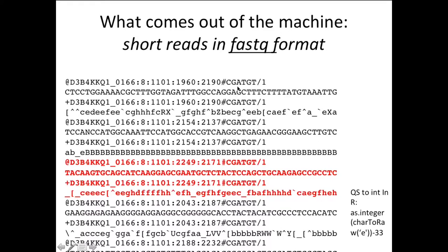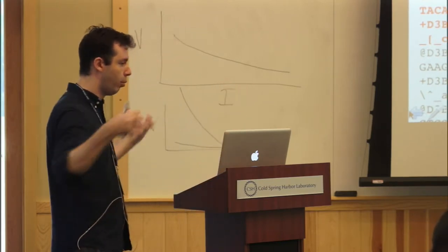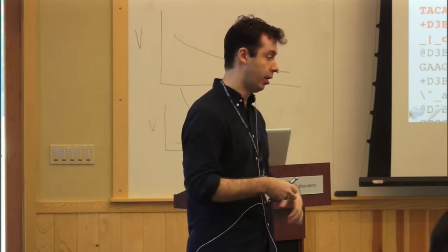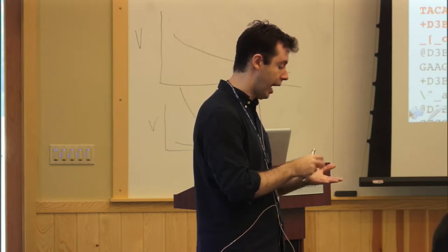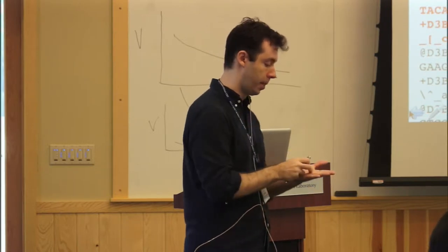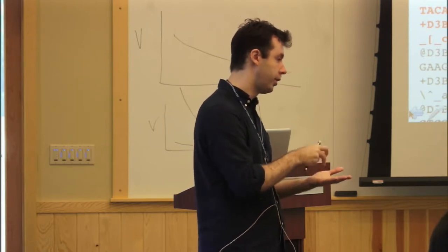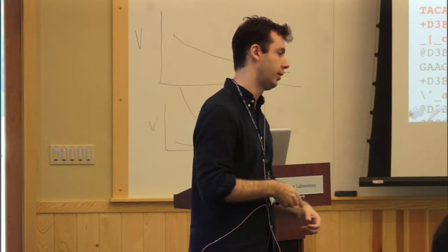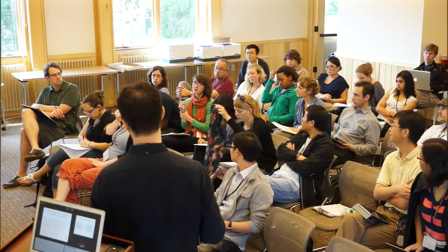Now, using high-throughput sequencing, because you can sequence so much, the lane is the unit of sequencing, what you can do is actually pool multiple samples within the same lane, right? You can pool DNA from multiple samples within the same lane, but you need to be able, when you sequence each fragment, to tell which sample it's coming from. So what you do is you add a little barcode to the DNA fragments, you ligate a little barcode, which is basically this, to the DNA fragments. You sequence the fragment itself and the barcode. You read the barcode, it tells you which sample the fragment is coming from. And you put each fragment in a different bin, essentially. That allows you to multiplex and to sequence multiple samples. So, barcode is the same thing as the index? Yeah, that's right.